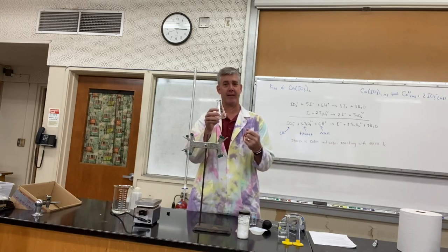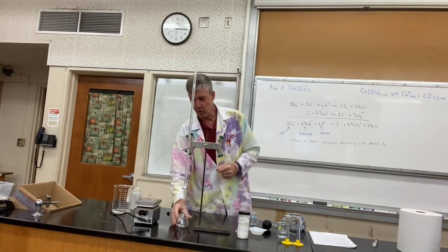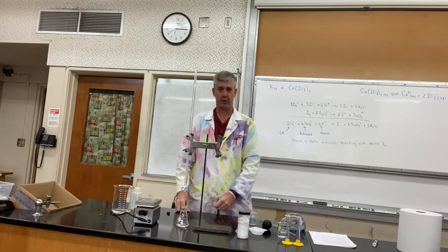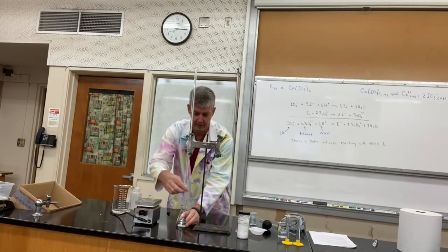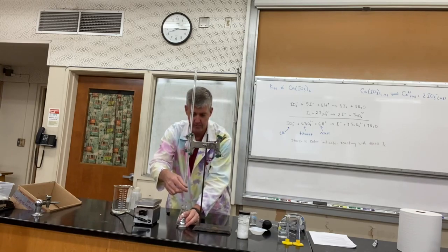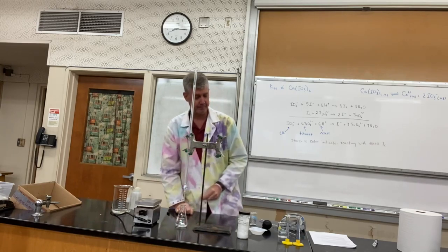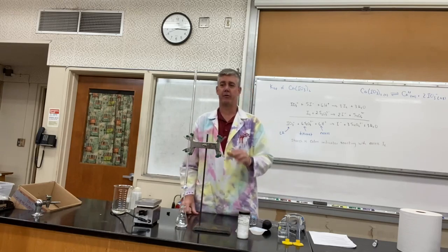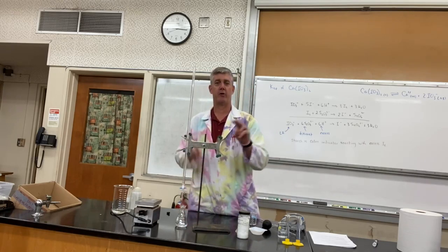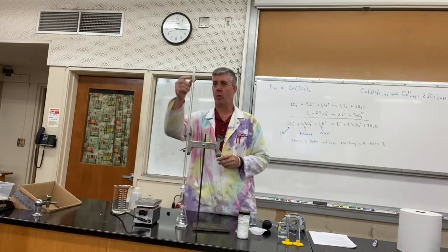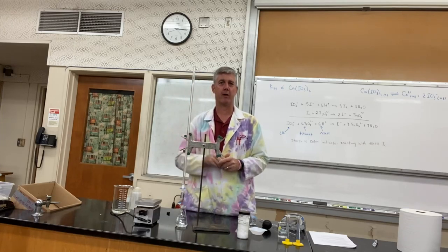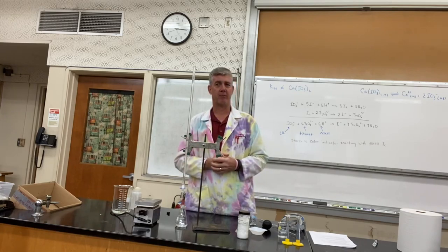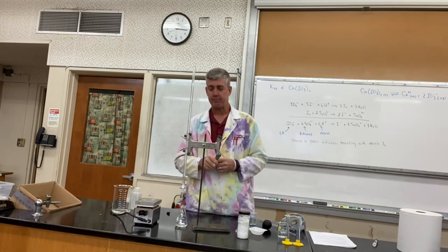Once we get our flask all prepped up and we have all of those reactants in our flask, if you want, you can use a stir plate and get that stir bar going. You want to make sure it's a really slow stir. We don't want a tornado, we don't want any splashing or splattering. That's one reason why we like to do titrations in flasks that have a narrow neck and not a beaker. In case there is any splattering, it's going to stay inside the flask.